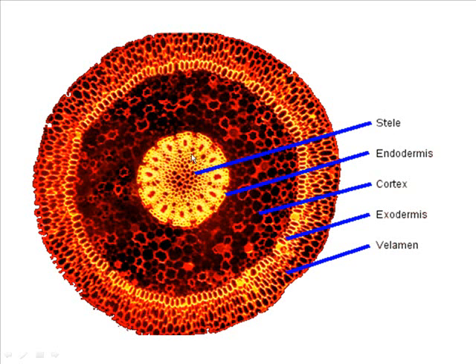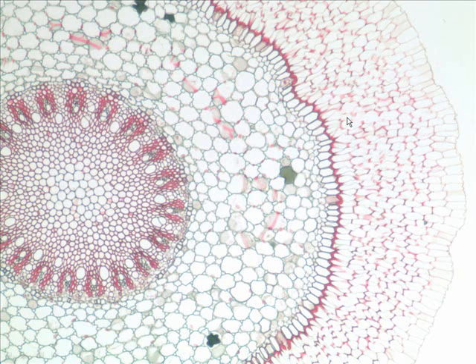But what word do we use? Well, first of all, what kind of tissue is this? The most abundant tissue in plants, it is parenchyma. Parenchyma tissue. And what region of the root would this be? This central parenchyma, it would be the what? The pith.